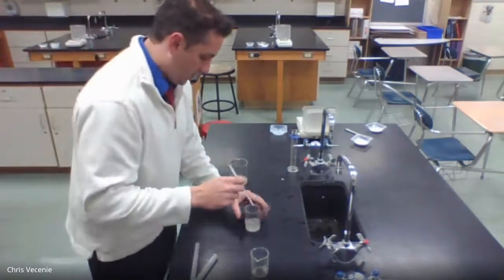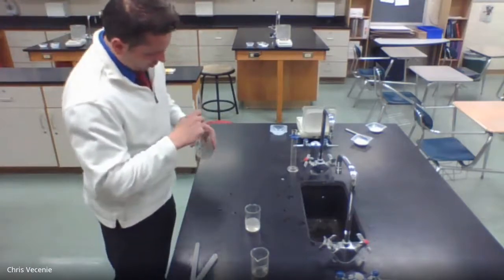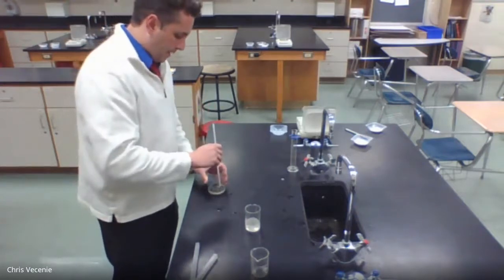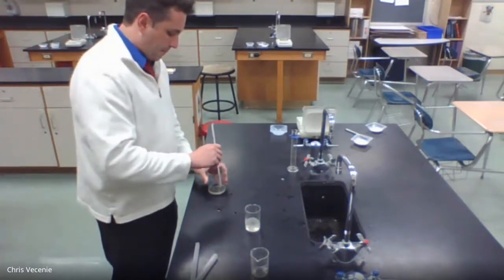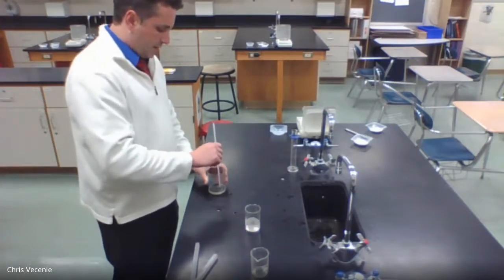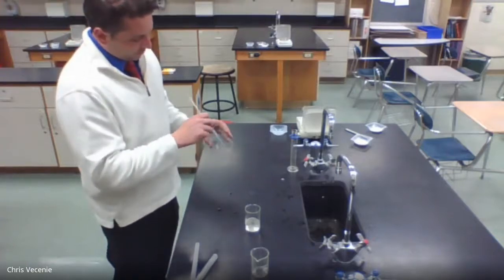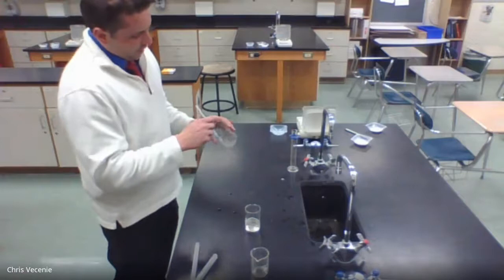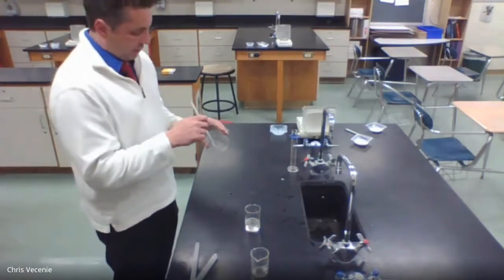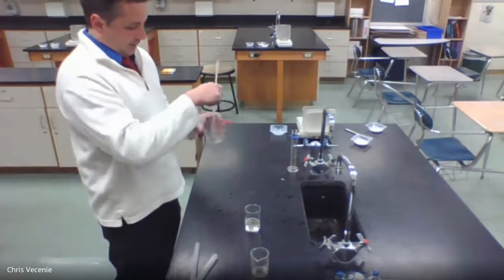Okay, so my sodium carbonate is fairly dissolved. Now, time to go to work on my calcium chloride. And one thing that might help is if you break up the calcium chloride at the bottom, it tends to dissolve better because you're increasing its surface area. And when you break it up to make it more like powder instead of those Dippin' Dot looking things, the water can attack it from more places.